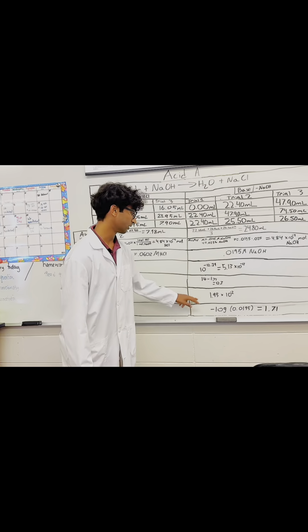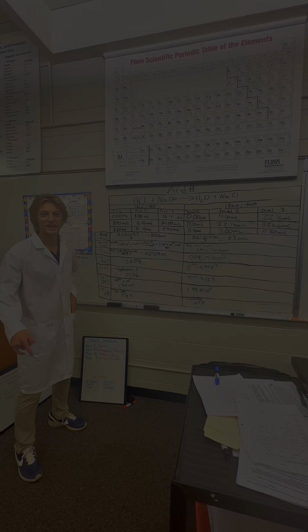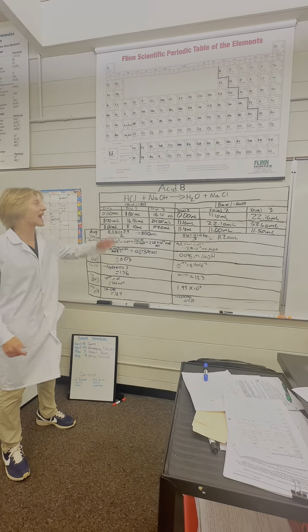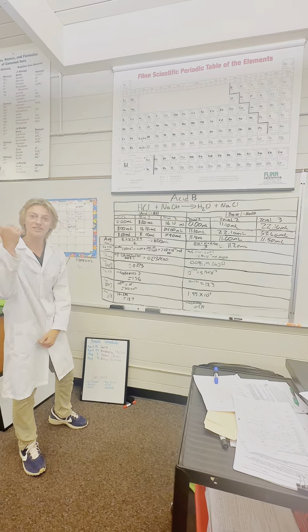And the same was done here. Yo, it's your boy, Jake. We're doing science, acid B, hydrochloric acid. So my friend Parth already explained this.